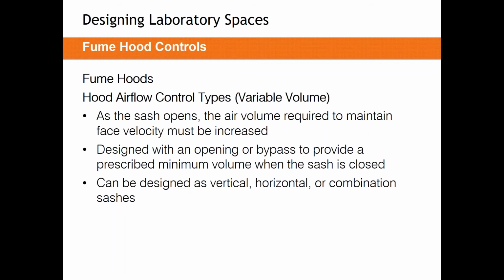When you hit that point, it's basically just a calculation on how much makeup air we can save on any given day or any given year. We can calculate what that 1 CFM costs per year. We'll explain that a little bit later. And we can balance that versus the usage of the more simple system in the constant volume fume hoods. It gets a little bit tough when those numbers come closer together, but when it's exaggerated and we're talking several hundred CFM, the decision should be pretty easy to go to variable volume fume hoods.